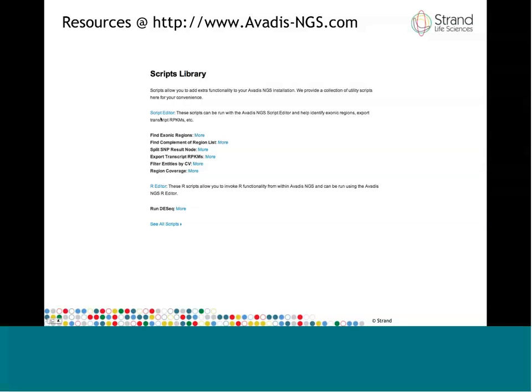There are two types of scripts. There are native scripts, and there are what we call R scripts. And I mentioned the DESeq methodology for differential expression analysis earlier, and this is where you can get the R script for that and instructions on how to run this R script.